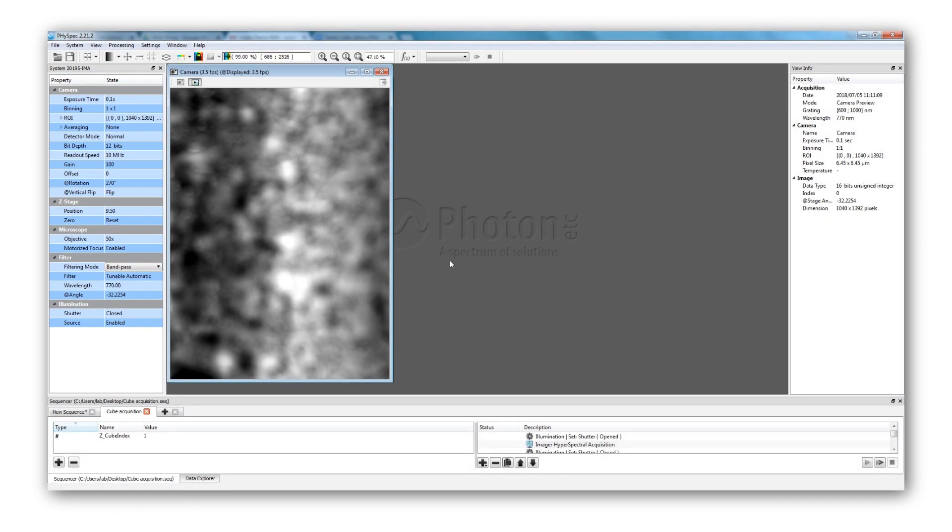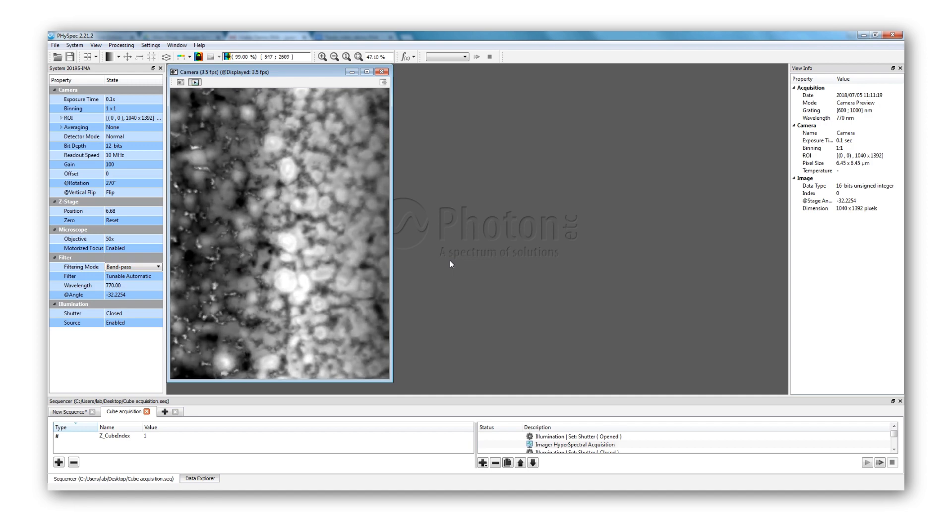It is possible to get the unfiltered image with the broadband mode. The first step of the experiment consists in focusing the image. In order to do so, a standard halogen lamp is directed to the sample, and we adjust the distance between the objective and the sample. Once we are happy with the result, we can turn off the white light and turn on the laser.